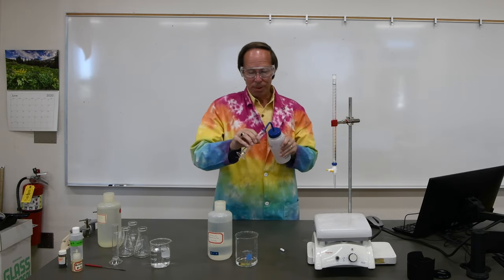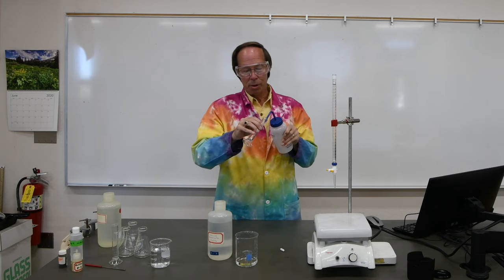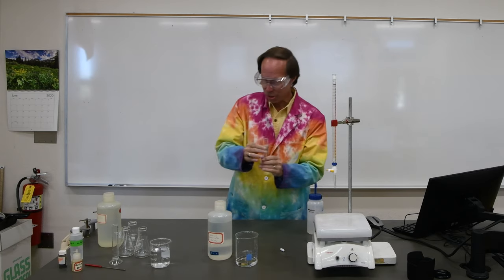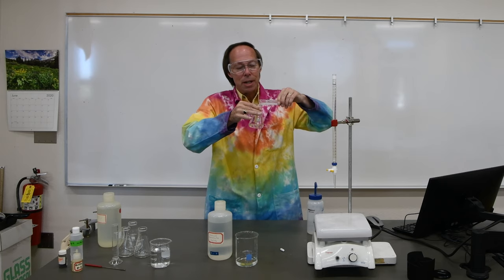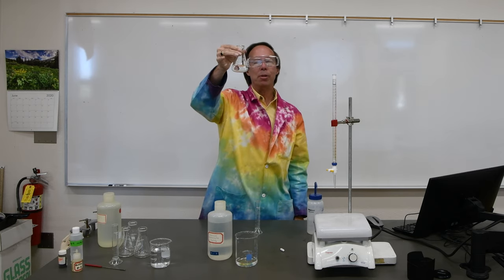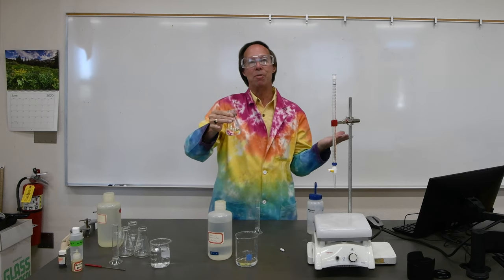So I'm going to simply fill that cylinder up with about 25 milliliters of deionized water, and you're probably thinking, oh my God, he's going to ruin the concentration. Well, it's not a problem. I can add all the deionized water I want to the flask. It still only has the original 25 milliliters of calcium. Adding deionized water doesn't make any difference.